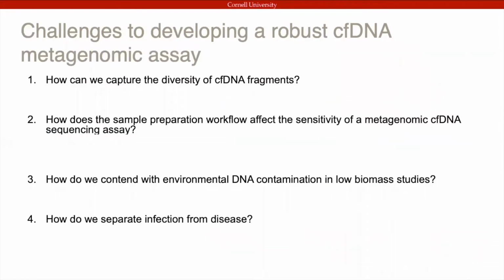There are many challenges to developing a robust cell-free DNA metagenomic assay. In my talk today, I'll just cover a few of them and provide some solutions for how we've tried to address them. The first question is, how can we capture the diversity of cell-free DNA fragments, which are known to be degraded?